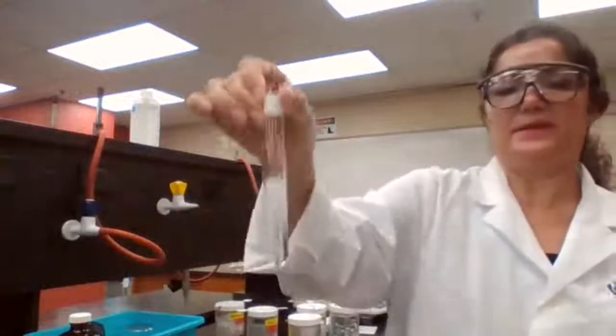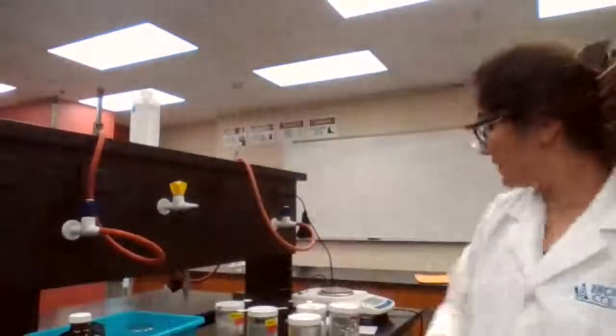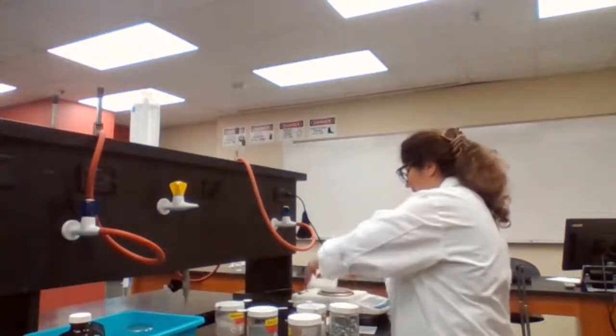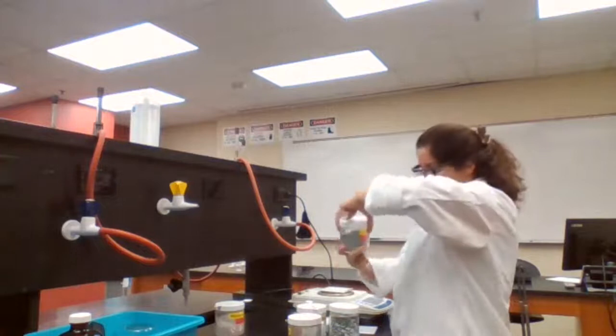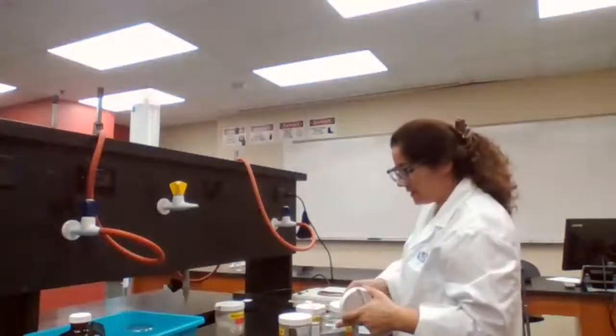0.6, almost there, but still a piece of magnesium still there. So I'm just going to give some time for 0.6. And while doing that, I can measure my granular zinc. I measure the zinc shot. Measure the granular zinc.